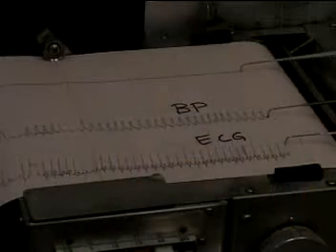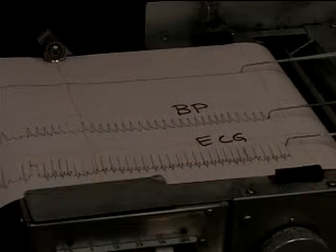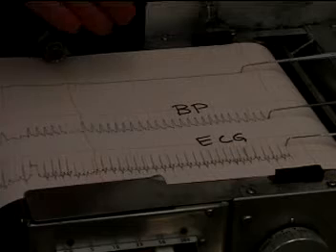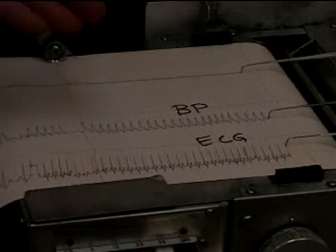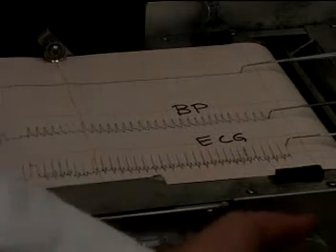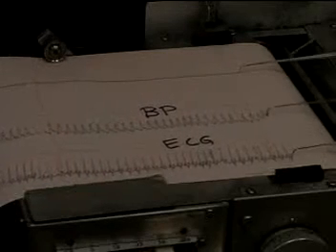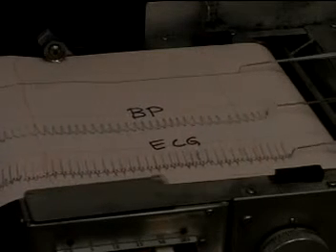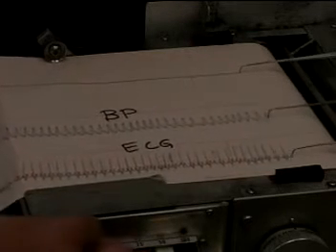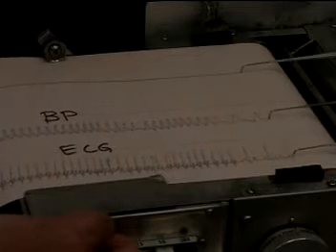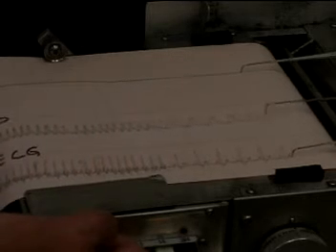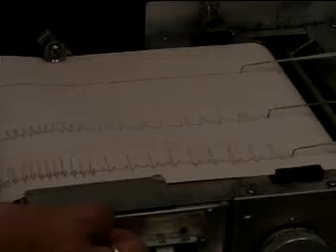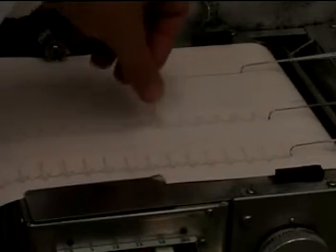We have three channels of data shown on our polygraph output. The top channel is a time signal, a second tick mark. Then we have arterial blood pressure and electrocardiogram. These are normal pre-injection responses. Here we see it at a faster speed and as you all know we're looking at both systolic and diastolic blood pressure and our standard EKG waveform.